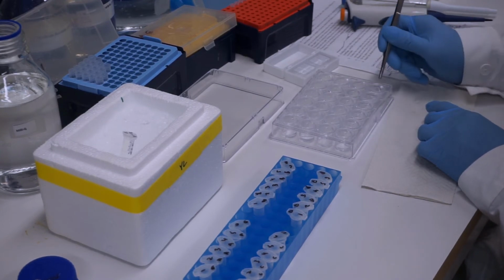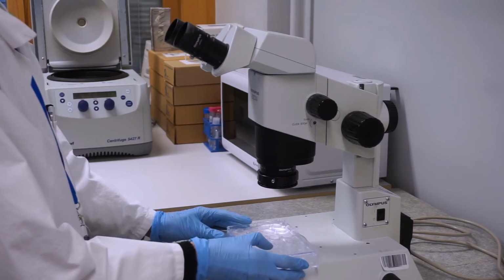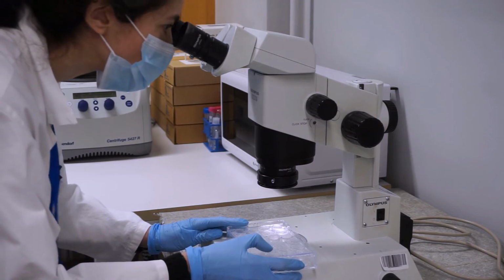Put the plates at room temperature for crystal growth. Inspect the drops every day.